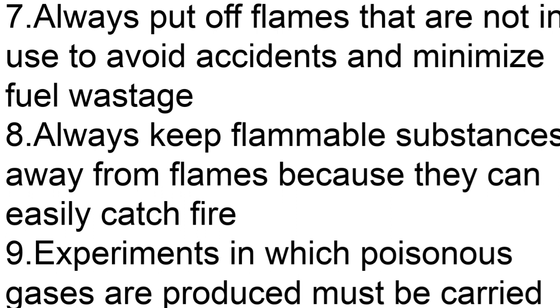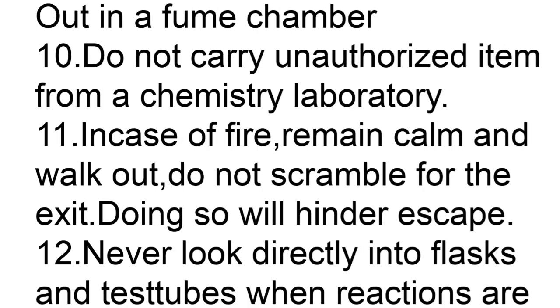Now, experiments in which poisonous gases are produced must be carried out in a fume chamber or in the open. In cases where we don't have a fume chamber, it can be carried out outside the laboratory in the open. Another rule is do not carry unauthorized items from a chemistry laboratory. Students, don't pick anything from the laboratory and take it outside or carry it with you. Leave everything in the laboratory after class.